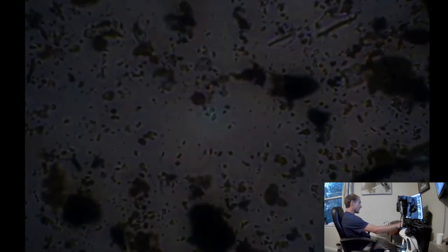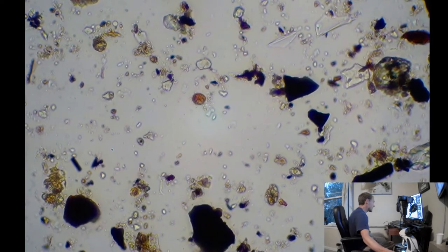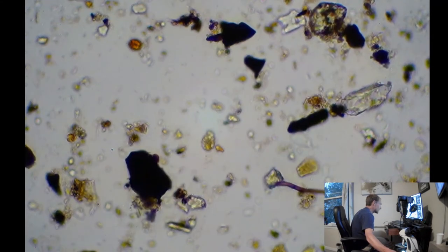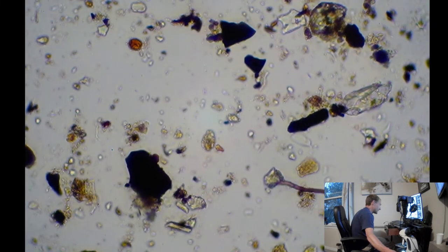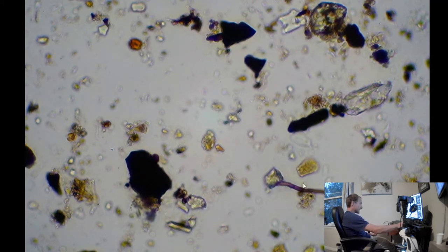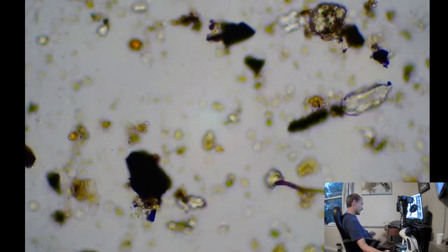Yeah, I kind of wanted to see if this was a... Oh, wrong way. I want to go into here. Take one last look in at 400X. There we go. Take a look at the bacteria. Oh yeah, it's a nice fungal hyphae there. It doesn't actually look attached, just looks touching. I think it's just on top of it. I was hoping it was attached, because that's what they'll do. They'll grab onto the silt and extract nutrients, phosphorus, all sorts of stuff from these little minerals or sand particles. Fungi are really good for that.